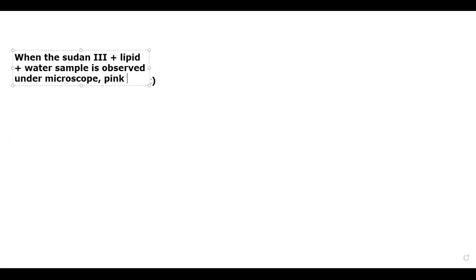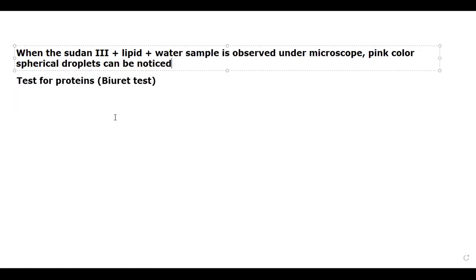Pink colored spherical droplets can be noticed. Clear? Clear, sir. Good. Complete it.